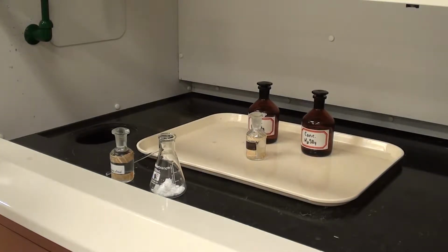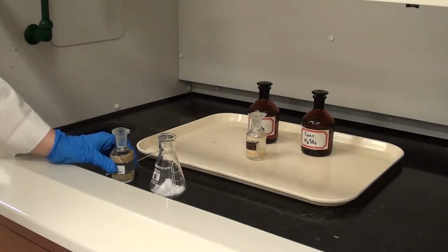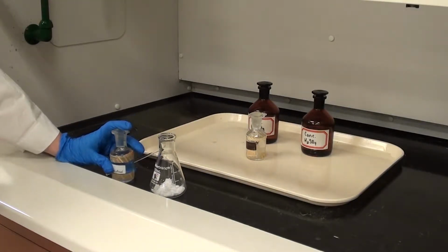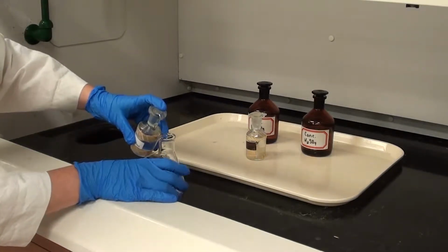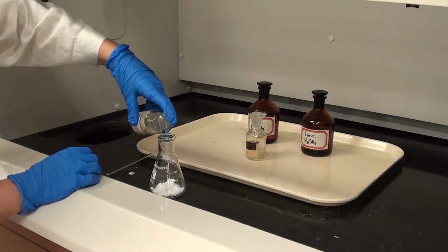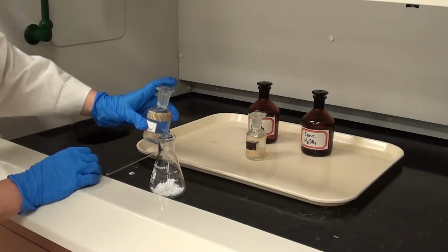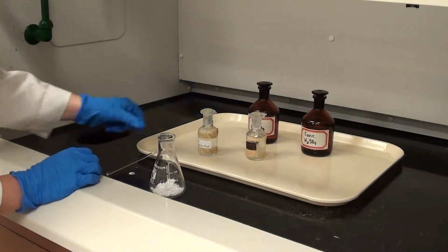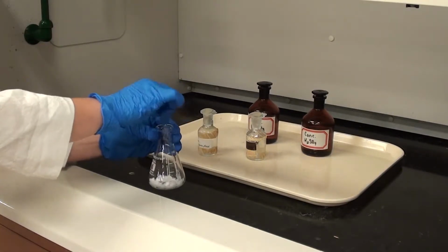And now what Cassie's going to do is she's going to pour 4 drops into her flask. And the way she'll do that is she'll put her finger on top of the stopper. There we go, like that. And then just lean it over. As long as that's in line, then it should just drop out automatically. Don't take the lid off. Okay, there we go. 4 drops. We're done. And she's got a stirring rod there, and she's going to start stirring that solution.